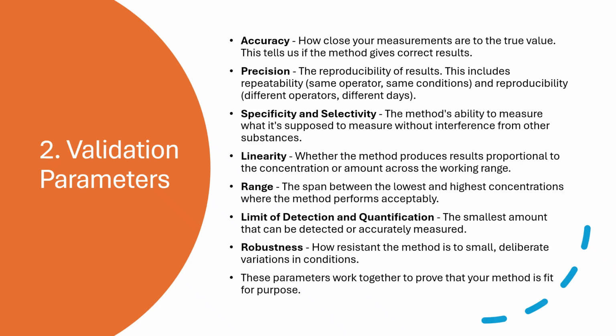And in LOQ, you can not only detect it, but you can also measure the quantity. So the criteria here is that it should lie between 70 to 120% recovery, and also the signal to noise ratio should be more than 10.